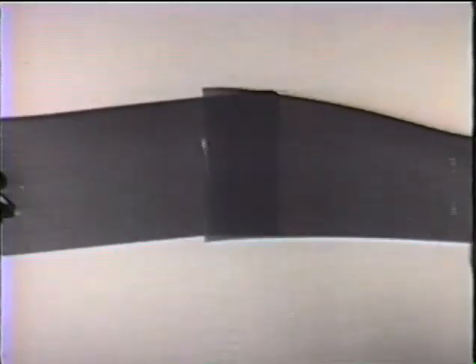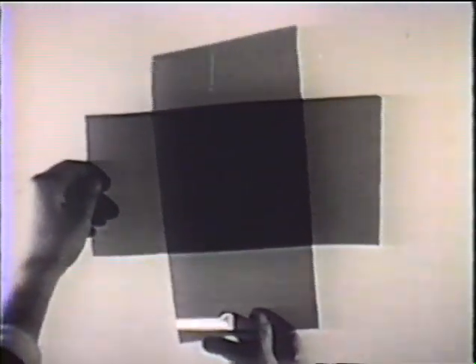Two sheets of polarizing filter, superimposed with their favorable directions parallel, will transmit the full polarized beam. When turned through exactly 90 degrees, the light is extinguished. A second filter employed in this way is called an analyzer.